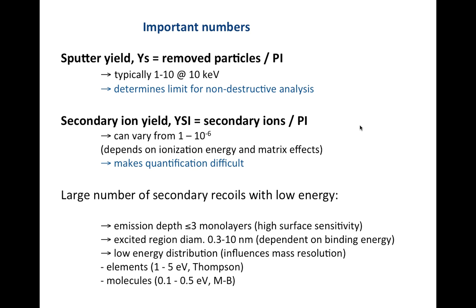So what we can say here is that if you want to run this technique, you have to keep in mind sputter yield and secondary ion yield.